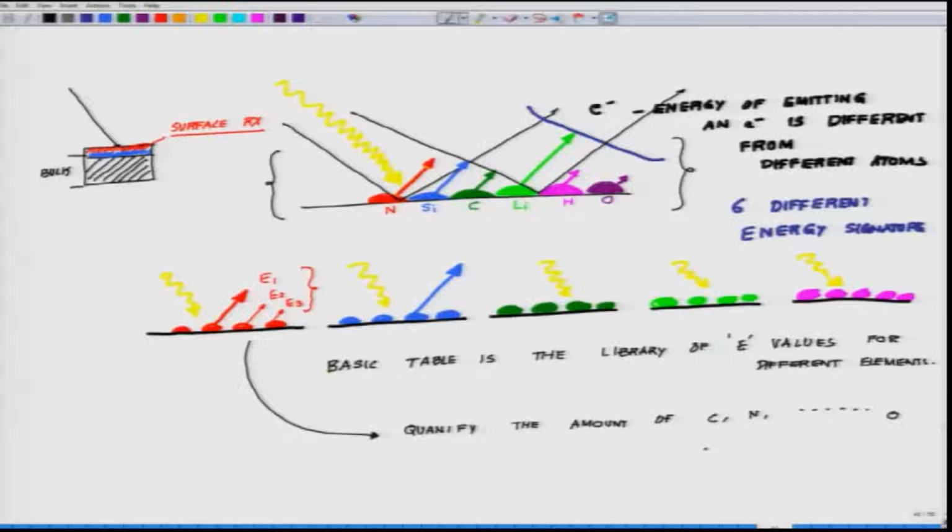Say for example, C is to N is to silicon is to lithium, just put some numbers, say 5 is to 1 is to 2 is to 0.5 or 1, whatever. So in that situation, you know this is the composition I am getting when I am coating the substrate with this specific material, right?